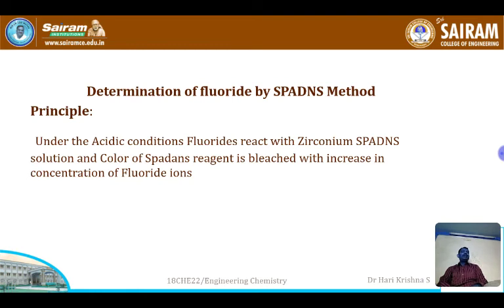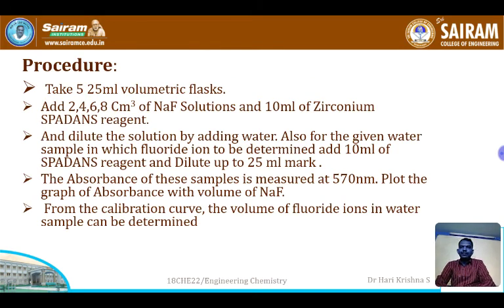The intensity of the color bleached will be measured using colorimetry. The absorbance will be measured. So let us see how to carry out this experiment.